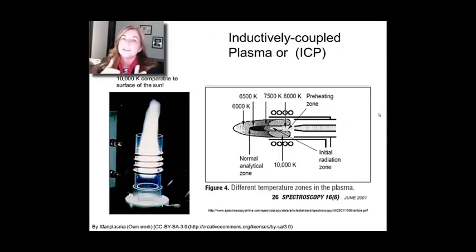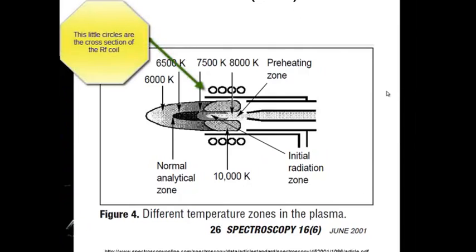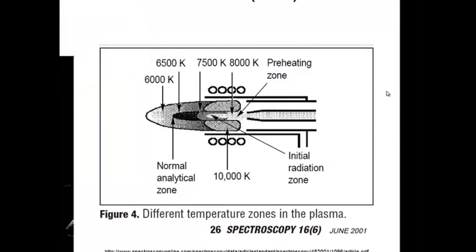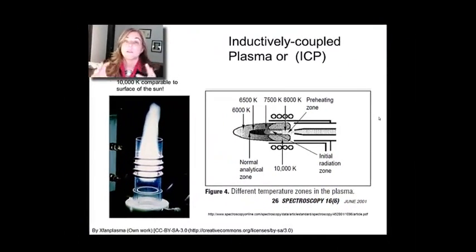And also, you can have a buffer gas behind it, and you're also dealing with your sample itself spraying in. So it's a pretty complicated flow control problem. But nevertheless, the atoms from the argon are being formed, and they end up going into what's called an RF coil, where there's an oscillating electromagnetic field there. Now, if they're just neutral atoms, they're just going to sit there. But there will be a spark that has to happen.